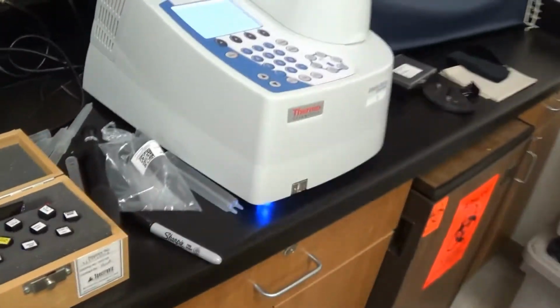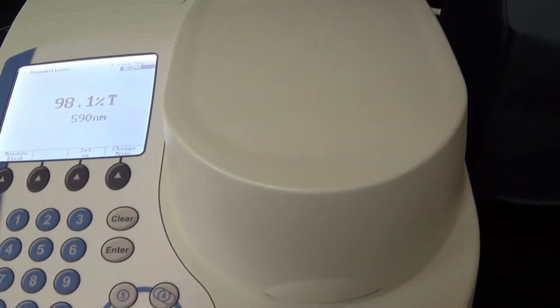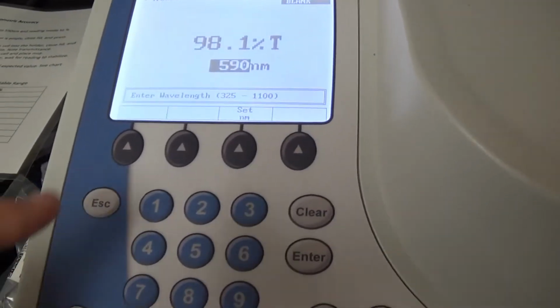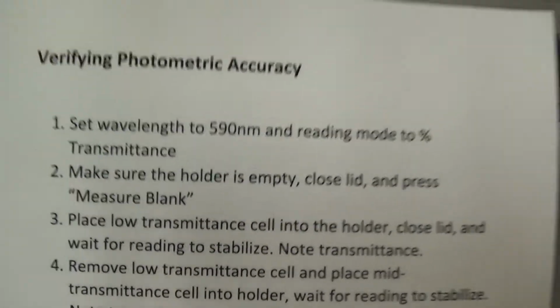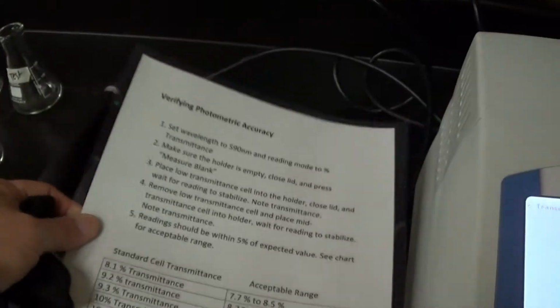I am going to get the spectrophotometer ready. We are going to be switching to the rectangle cuvettes, but before I do that, I need to make sure the spectrophotometer is working well. So I'm going to get out my directions here. Verifying photometric accuracy. I need to change the wavelength to 590. It is already on 590. And we are verifying the photometric accuracy using transmittance. So make sure the holder is empty, close lid, and press measure blank. Then we are going to follow the rest of these directions.